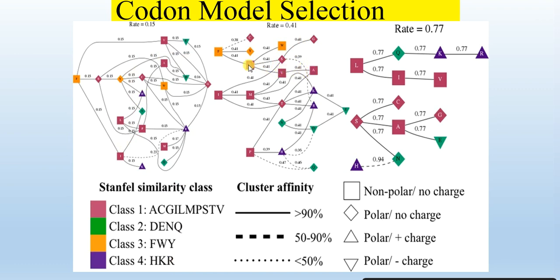Through the color you can easily understand which class each amino acid belongs to. The solid lines show that two amino acids have greater than 90% cluster affinity. Dotted lines indicate 50 to 90% cluster affinity.